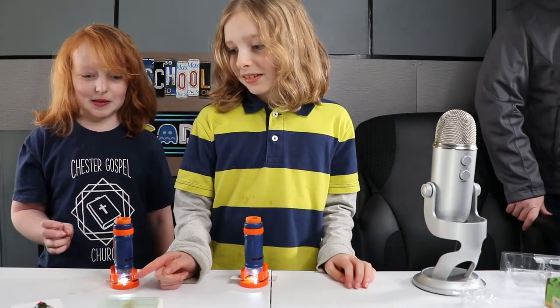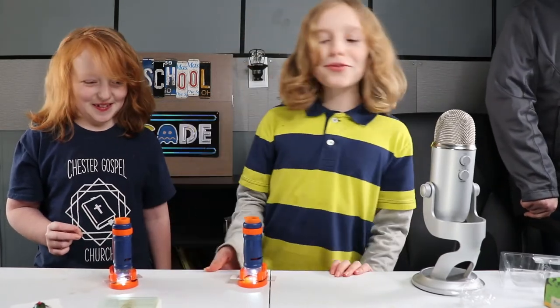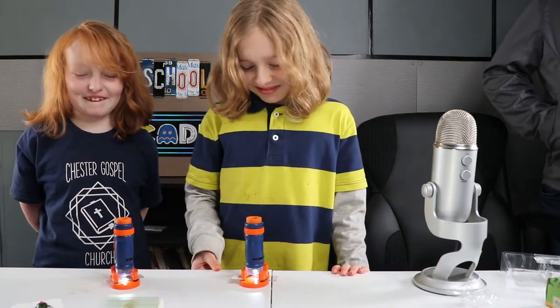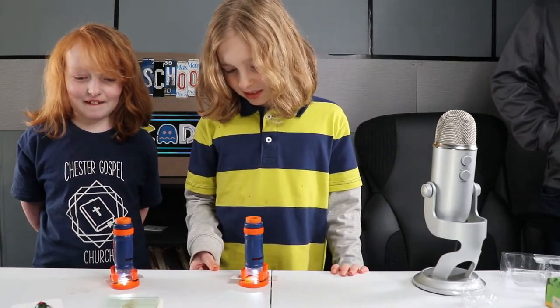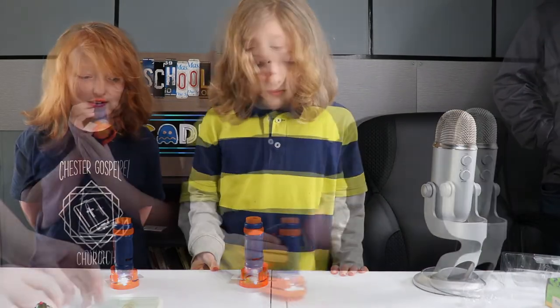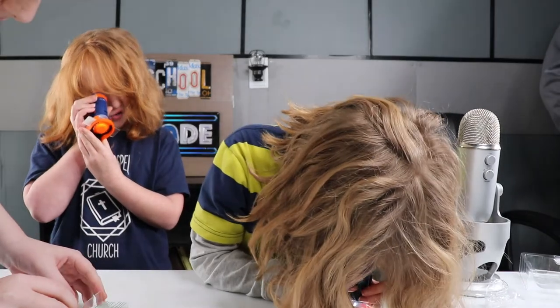Yes, it's a real scarab beetle — it's very much dead. That's from the bug slide kit. It comes with all those different slides and we put a couple of them on the microscopes for the kids to see. Whoa, cool!